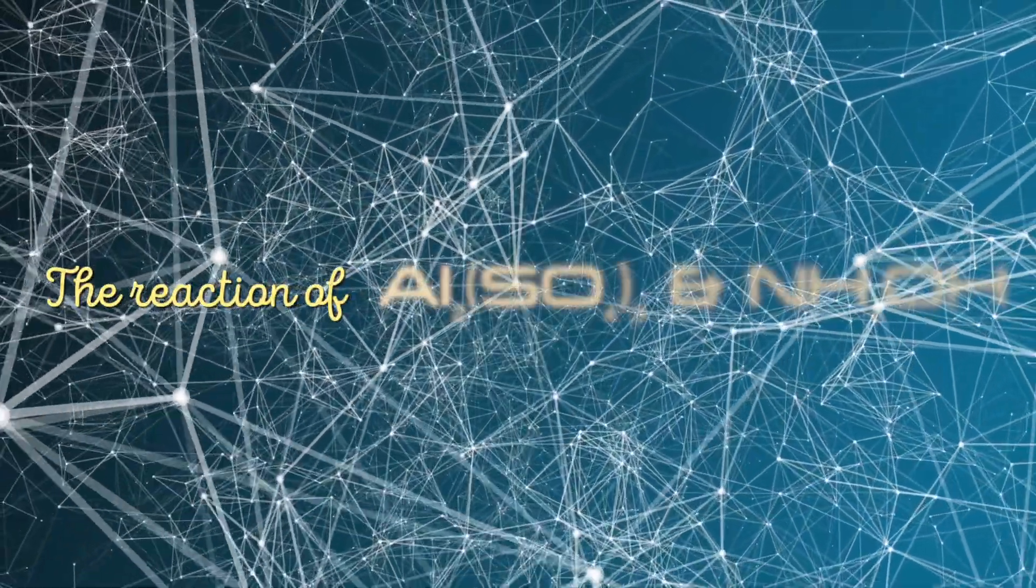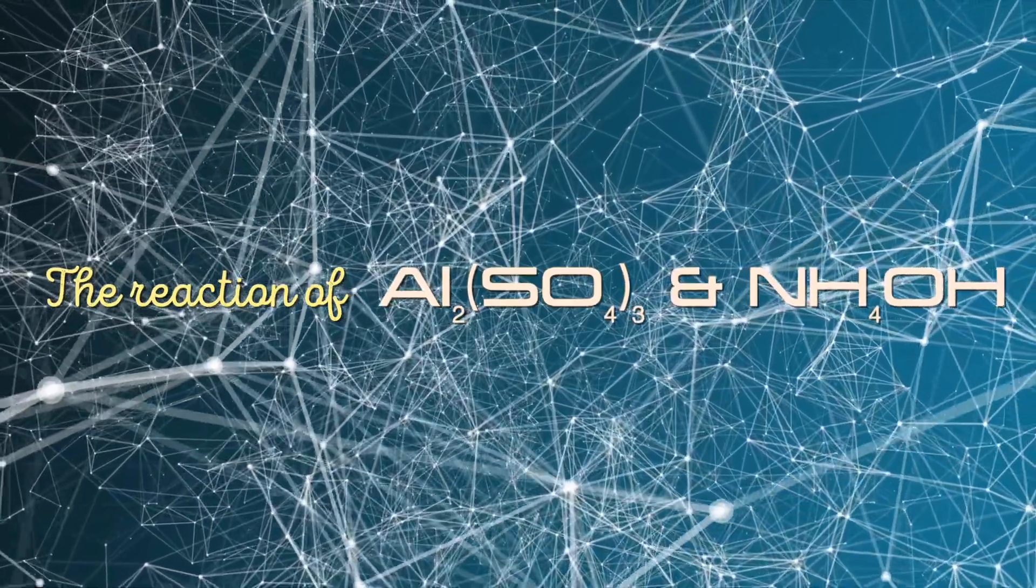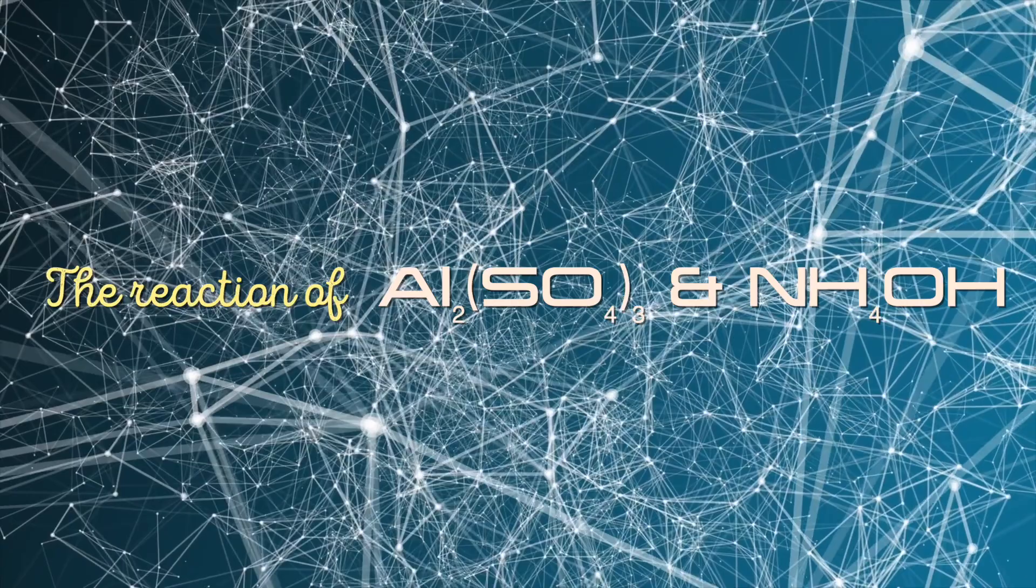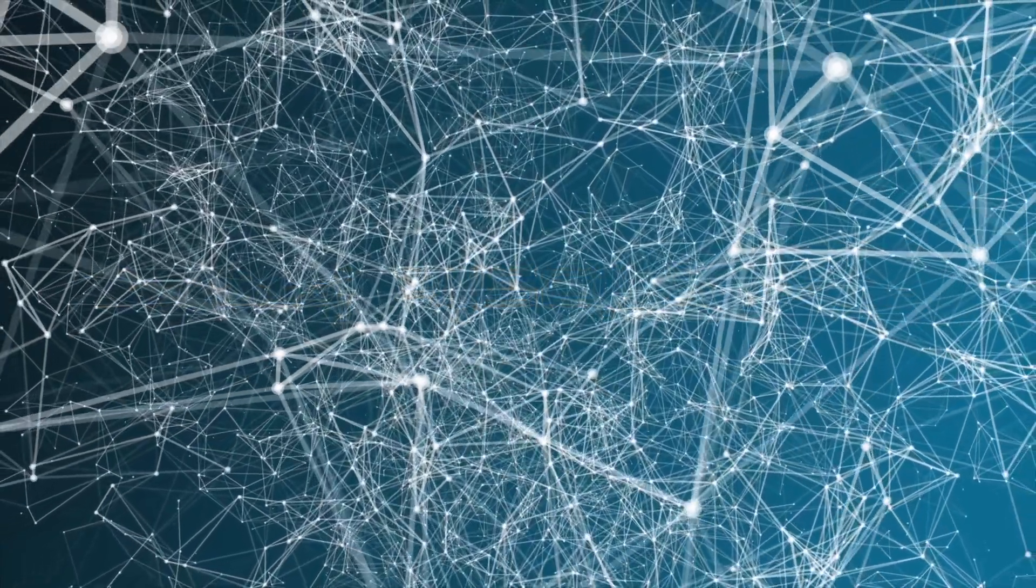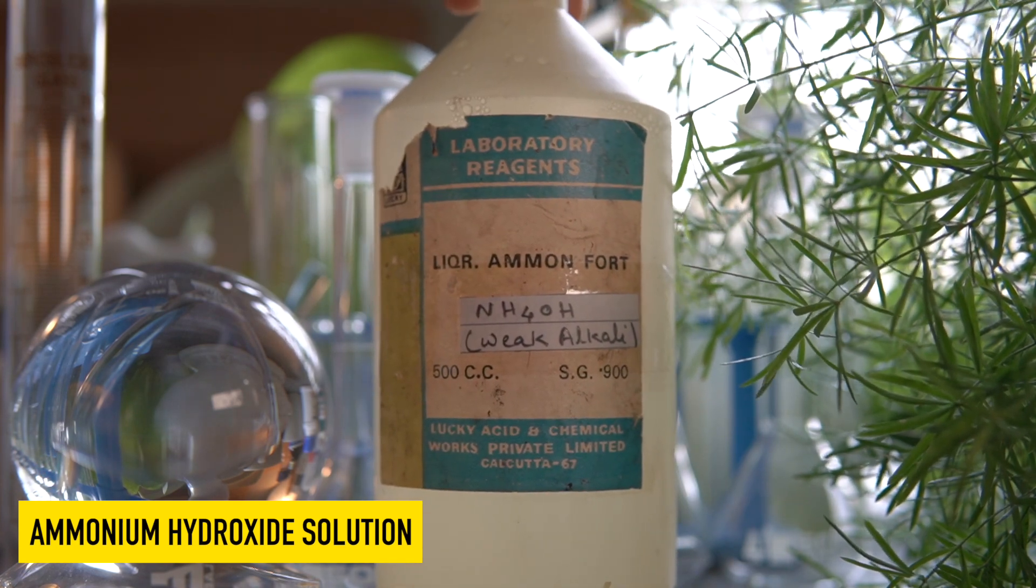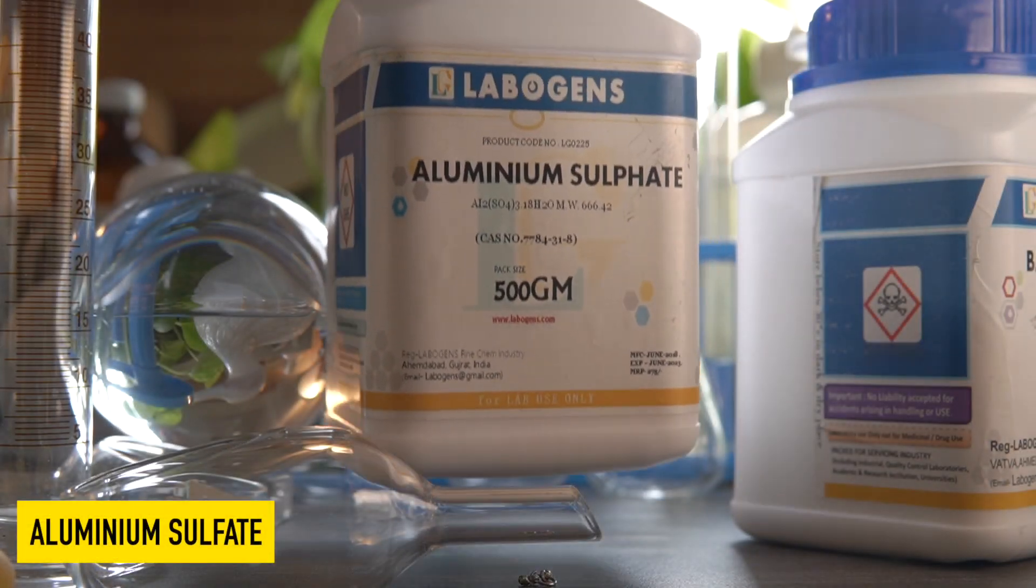Today we are going to observe a chemical reaction between aluminium sulphate and ammonium hydroxide. For this chemical reaction we need ammonium hydroxide and aluminium sulphate.